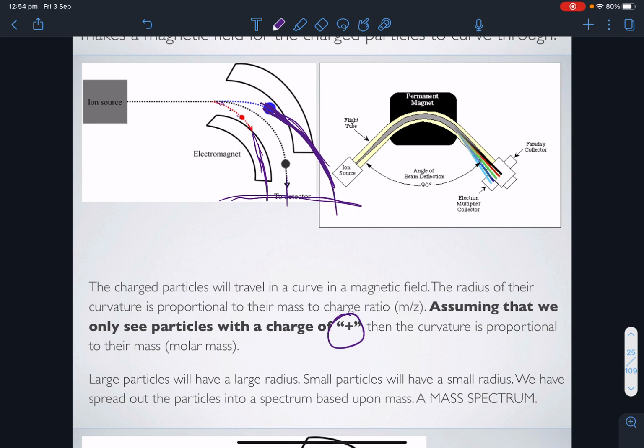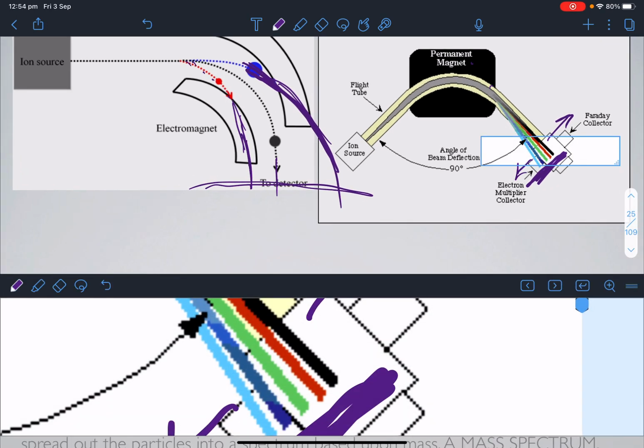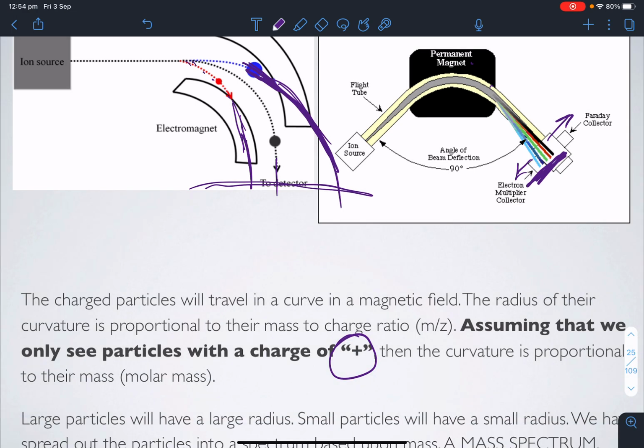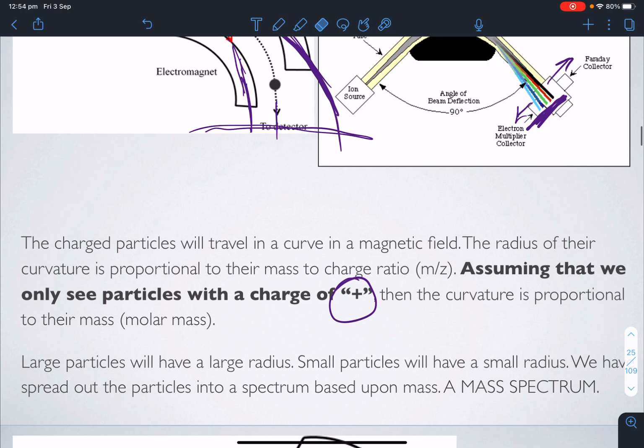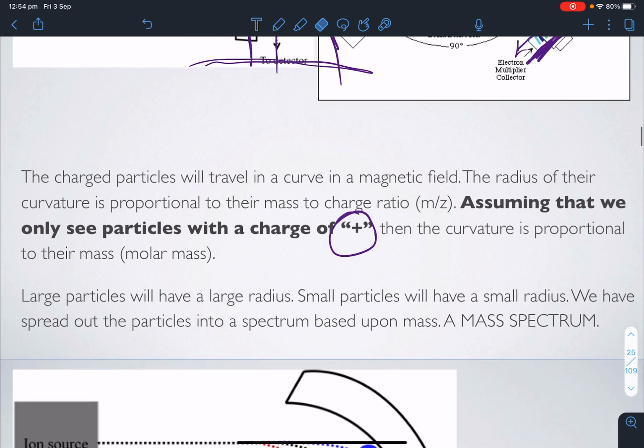This one's a GIF also, and it swings back and forth. So you've got a visual spectrum representing a mass spectrum there, but what the GIF shows is, well, it's an electromagnet, but you can change the magnetism of it, and you can swing this path back and forth. So you can see the blue stuff at one end, and then later on you can see the red stuff. Not that it's coloured that way, it's arranged by mass. You can see the light stuff, and then you can range to the heavier stuff.